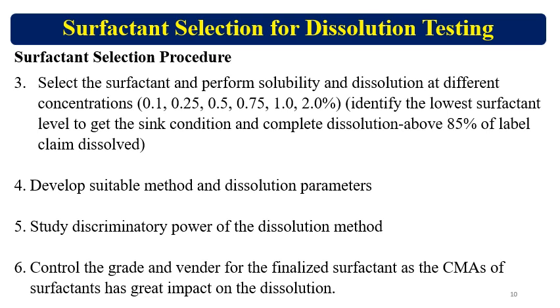Identify the lowest surfactant concentration to get the sink condition and complete dissolution. Complete dissolution means dissolution above 85% of the label claim.